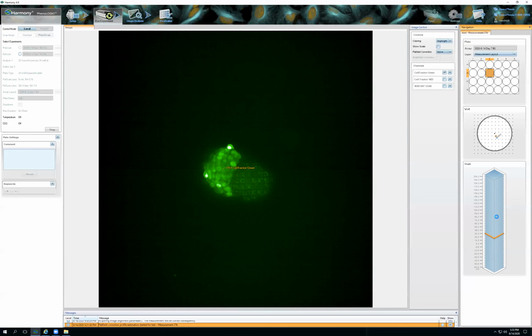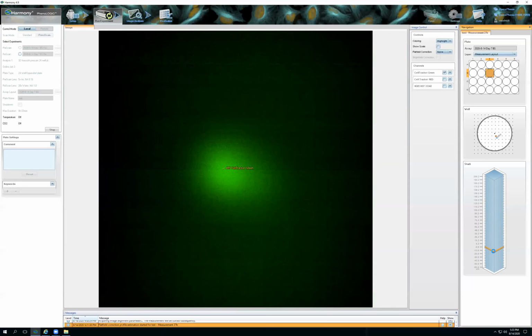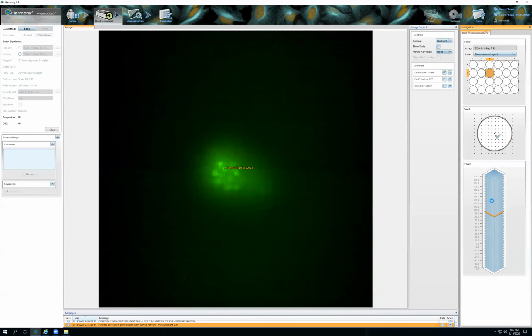The other thing that you want to look at while you're going through is how big your spheroid is. So you can say, okay, here's kind of like the last one. You want to make sure that you go down, but I could trim off some on the bottom and then same at the top. My spheroid kind of ends here, so I could maybe trim some off. I would look at a few different spheroids just to double check.